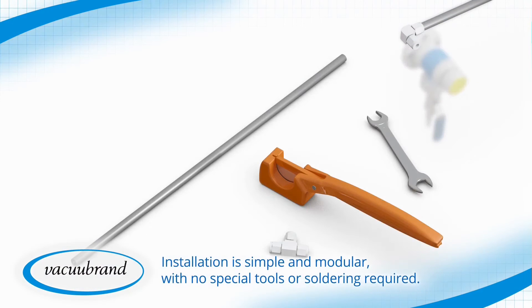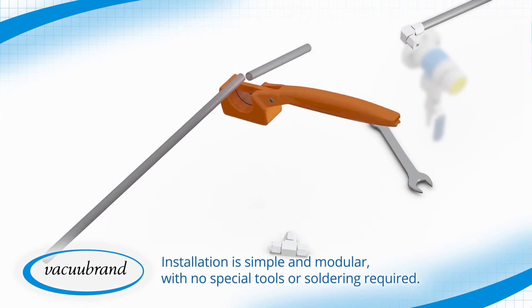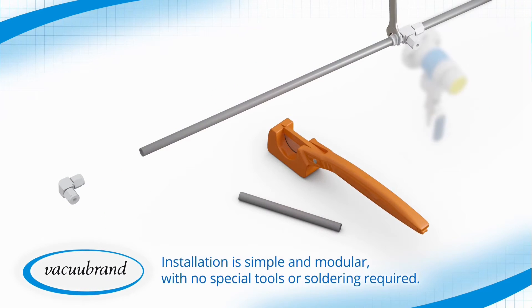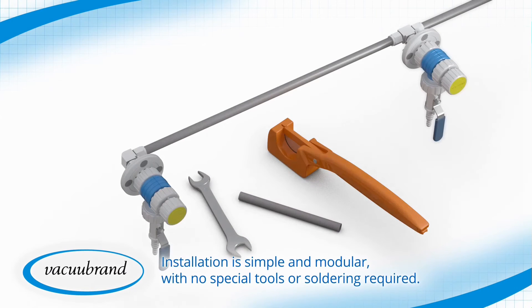Installation is simple. Tubing cutters and box wrenches are all that's required to cut the tubing and make the compression connections. No soldering is required, and the modular designs let you install the vacuum you need today and adapt as needs change over time.